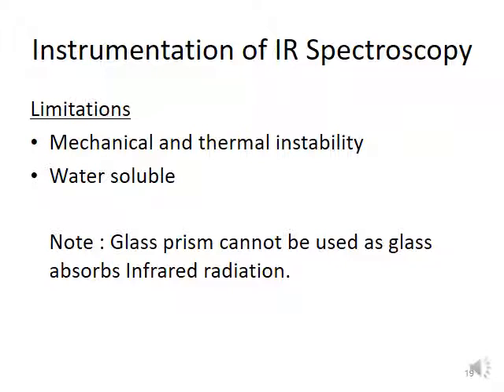Okay, so just take note that a glass prism cannot be used as glass absorbs infrared radiation. So you need to choose another compound that does not absorb infrared radiation.